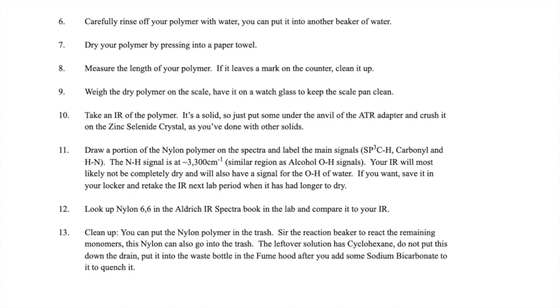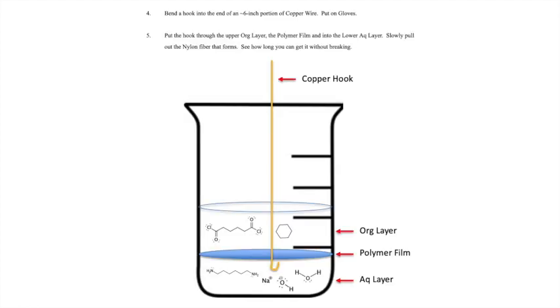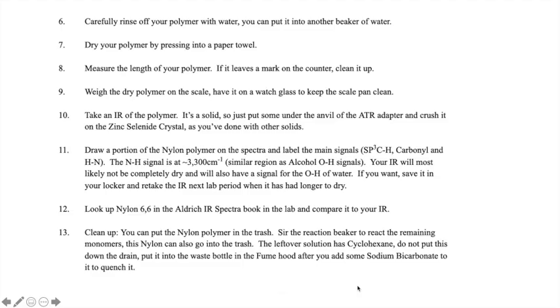But then there was a performance enhancing era for a while there. Remember, it was Hugh and some other students. They wanted to beat Nikki Nylon's record, so they were cheating a little bit. Instead of using 10 milliliters of each solution, I think they went like 20 milliliters of the aqueous, 20 milliliters of the organic. So they had more reagents and were able to pull longer. That was during the performance enhanced era. I was going to try to use about 10 milliliters, but I think I wound up being like 15 milliliters because I was just doing it quickly. But I still didn't even come close.